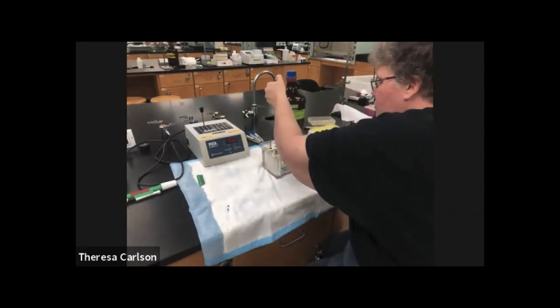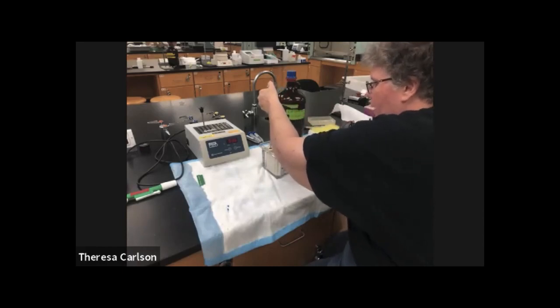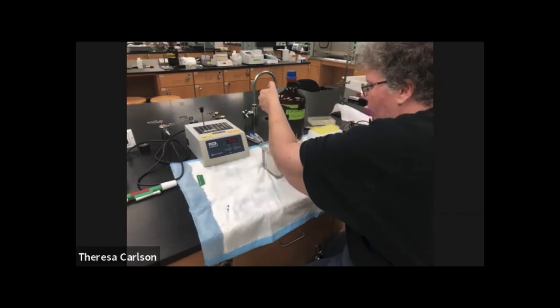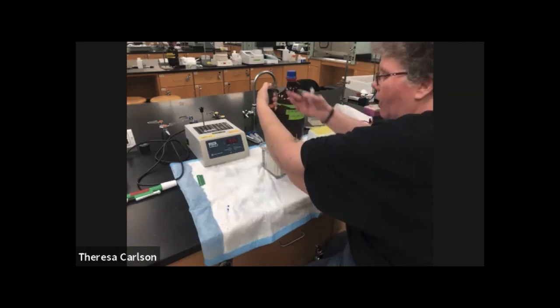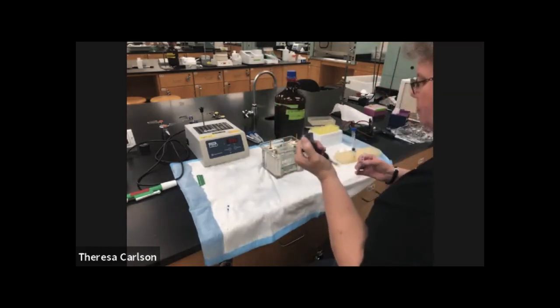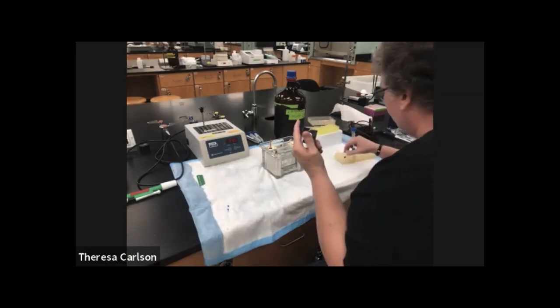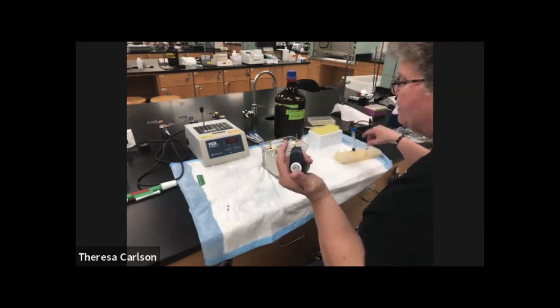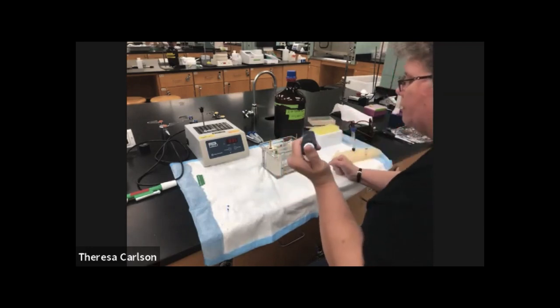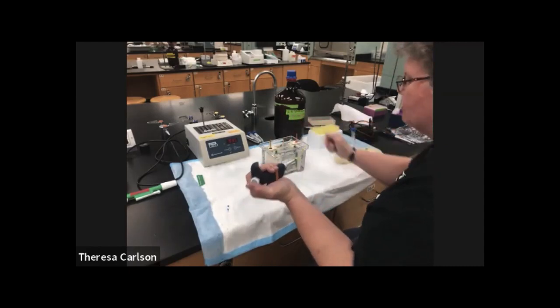So to load your sample, you want to get a sample in your pipette. You want to put the pipette above the lane and you want to expel it into the lane. Then when you finish expelling it into the lane, don't let go of the plunger. You're going to bring it up before you let go of the plunger. Otherwise, you're simply going to be sucking up the solution again that you just put in the lane. You can use the same pipette tip twice if you're simply loading S1 in both lanes. You don't have to change pipette tips if you're loading S1 and then the same sample of S1.